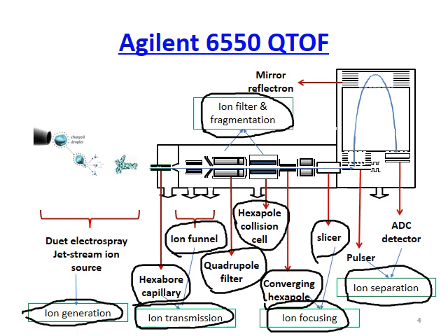As you are all aware of, when ions being sent to the TOF, the time of different ions travel through the long flight tube will be measured, and the time will be converted to their m/z, and all these will be detected by the ADC detector. Alright, so this is basically the whole design of 6550 QTOF.